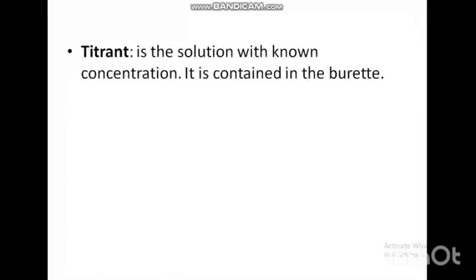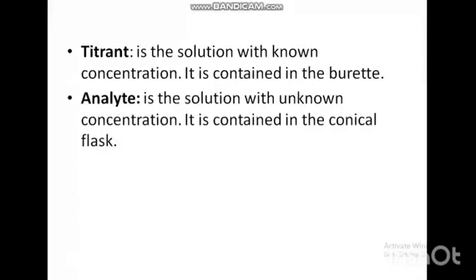Titrant is a solution with known concentration. It is contained in the burette. Analyte is a solution with unknown concentration. It is contained in the conical flask.